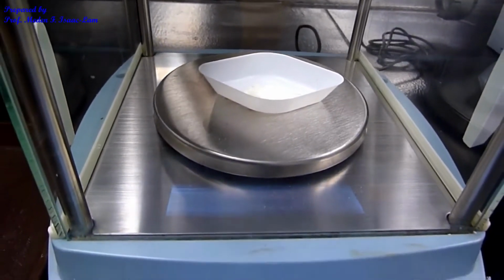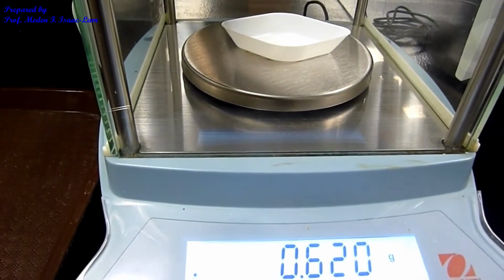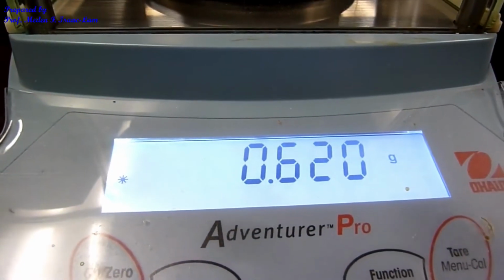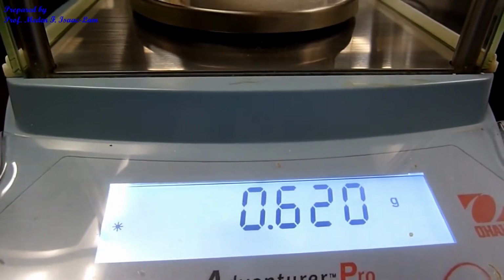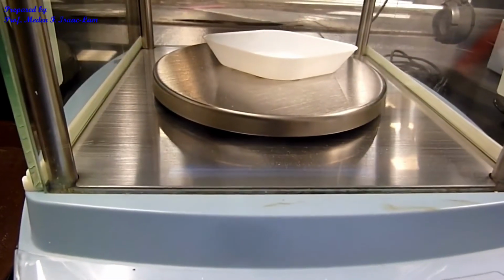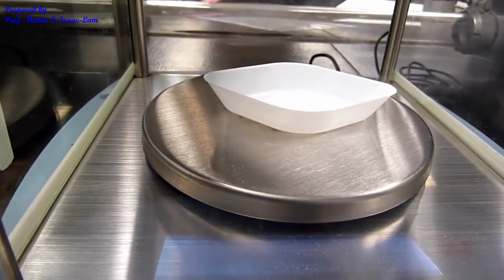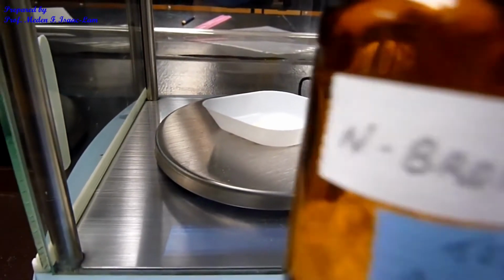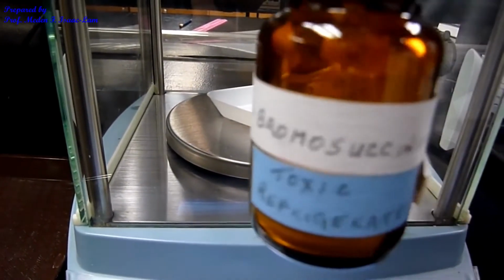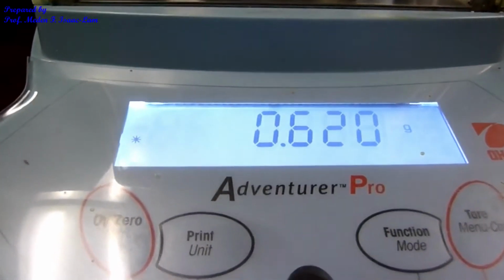This is now the reactant, which is NBS. I weighed 0.620 grams of NBS. That's N-bromosuccinimide. This is our brominating agent. It's a white powder, and this is the original container of N-bromosuccinimide. So write down the weight, please.